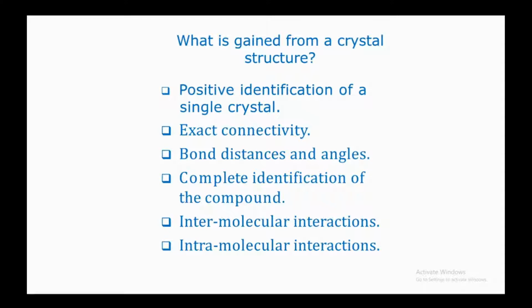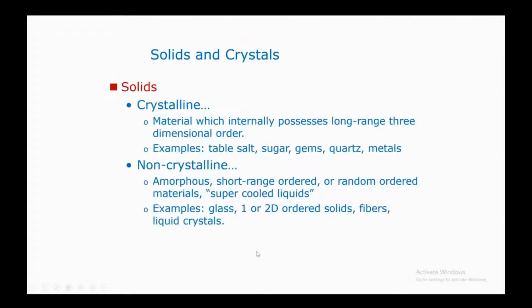But if there is one technique, one result or one instrument that can give us 100% surety and confidence about the structure, that is single crystal XRD. Intermolecular and intramolecular interactions can also be visualized from the single crystal structure.